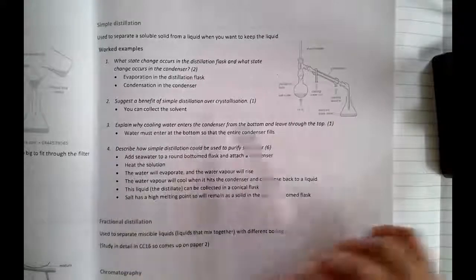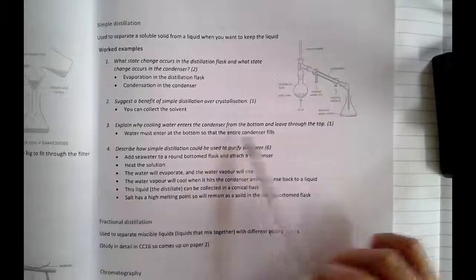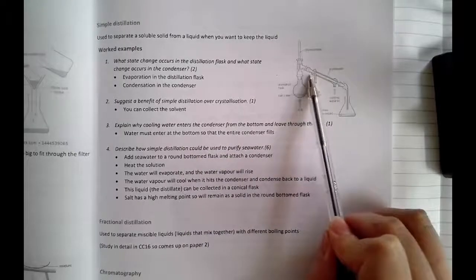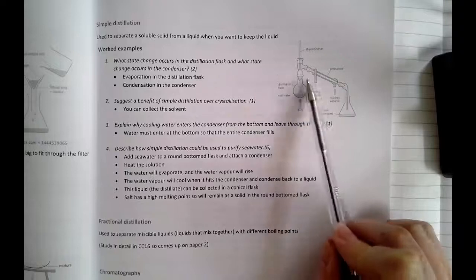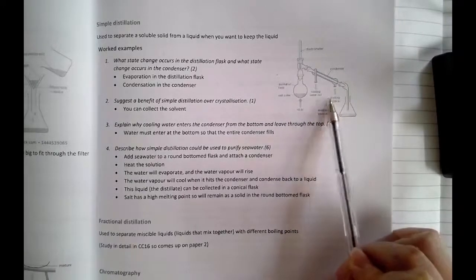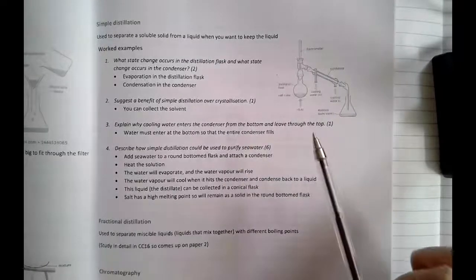Why does your cooling water enter from the bottom and leave from the top? Because it must enter from the bottom so that the entire condenser fills. If it enters from the top, it won't fill the entire condenser. It will just fill the bottom half of the condenser. That's a really common question. They can ask you to label the distillation apparatus. You need to know that you put the water in at the bottom and it comes out at the top, so that the entire condenser fills.